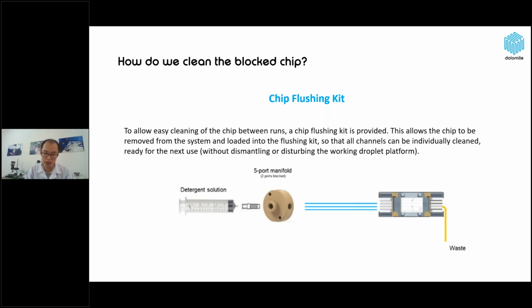Basically it is very simple. It includes the edge interface with the linear connector, or the top interface, depending on what type of chip you are using. If you use the larger drop junction chip, we have the edge interface and linear connectors.